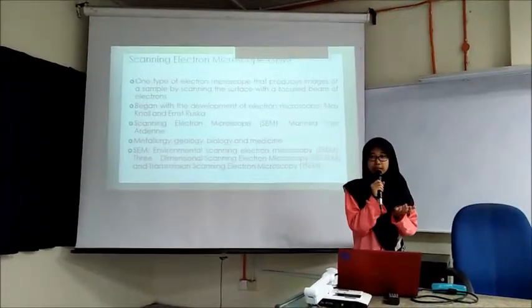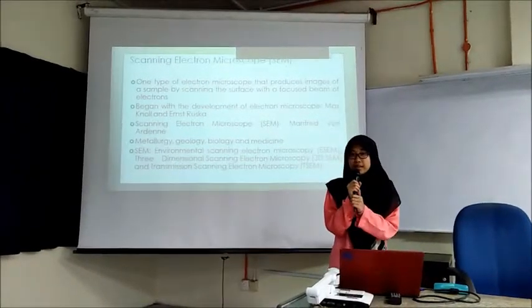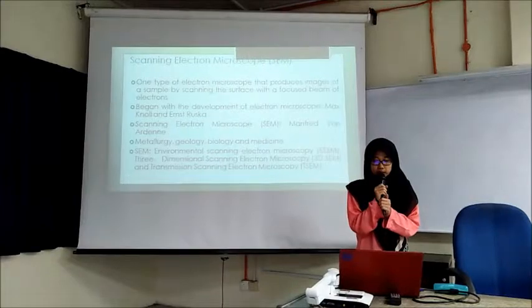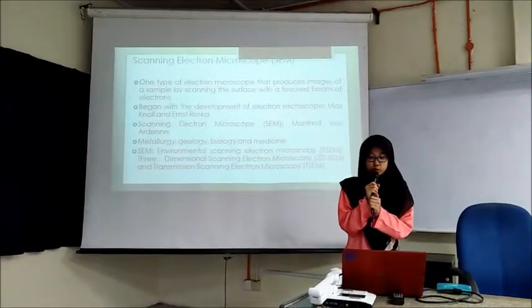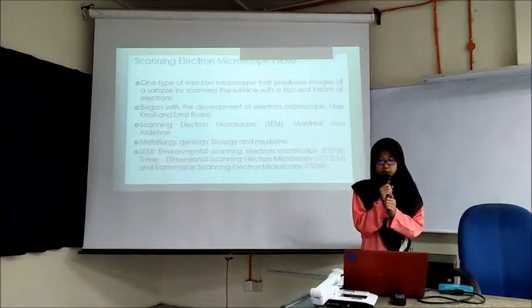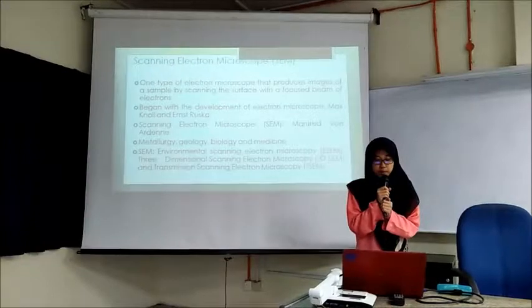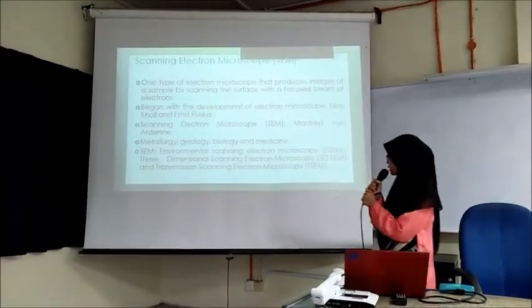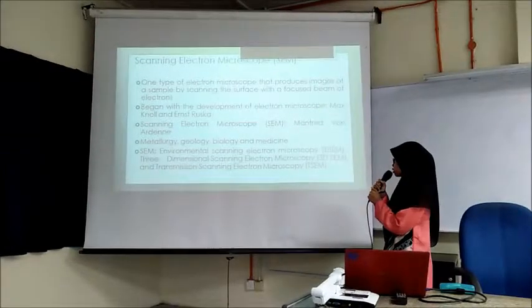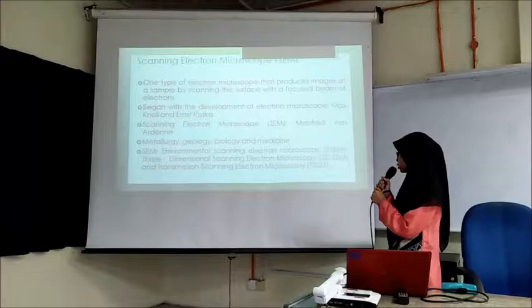After that, there were many innovations, designs, and types of scanning electron microscope. It is widely used in metallurgy, geology, biology, medicine, and many others. The types of scanning electron microscope are environmental scanning electron microscopy, three-dimensional scanning electron microscopy, and transmission scanning electron microscopy.